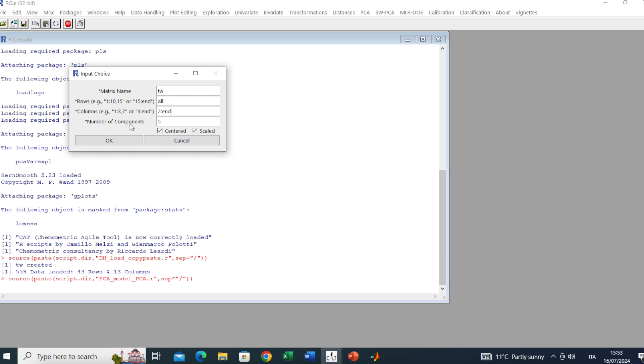Here the number of components, just a stop criterion for the NIPALS algorithm. 5 is fine but we can use 10. Here by default we have both centered and scaled. This is the pretreatment. Together this makes the autoscaling.